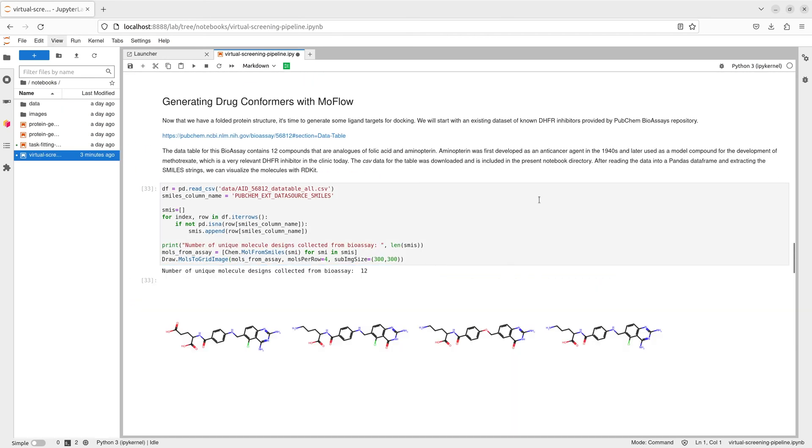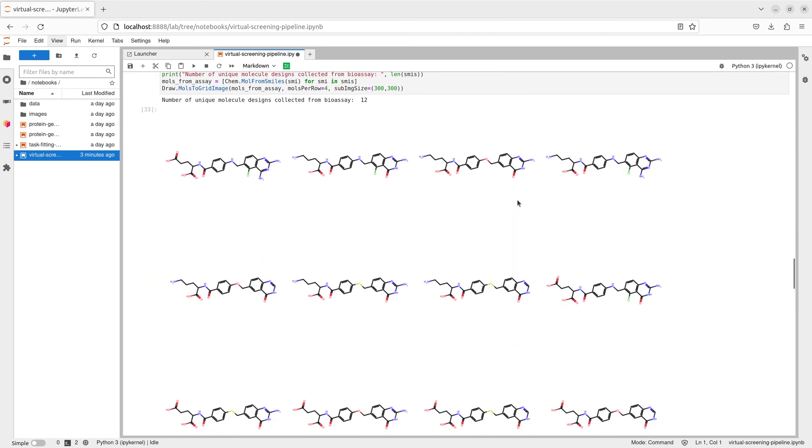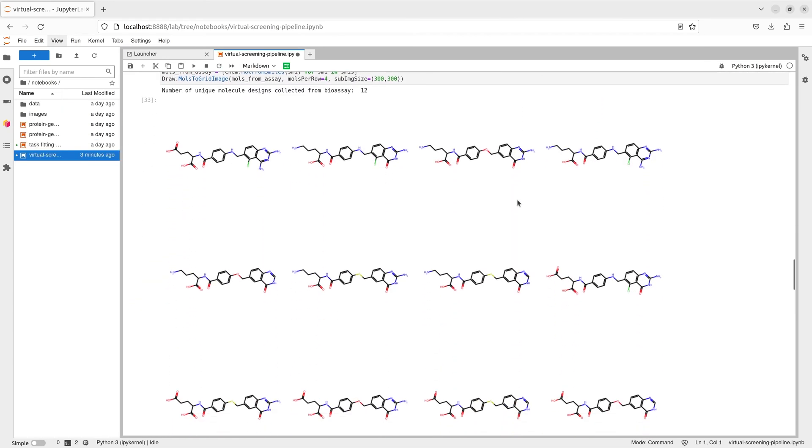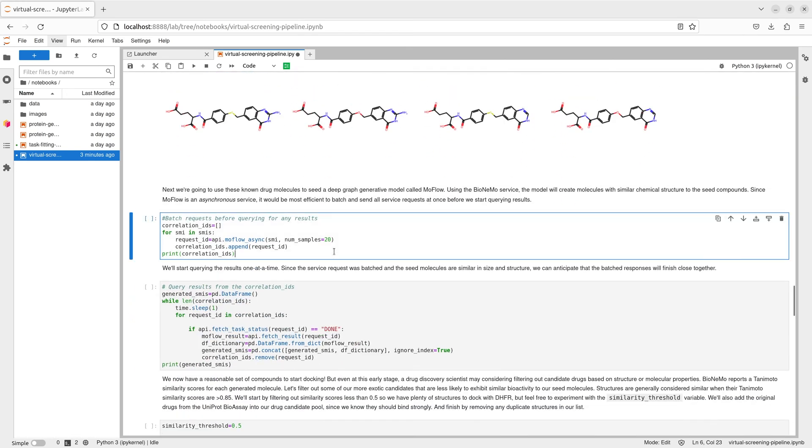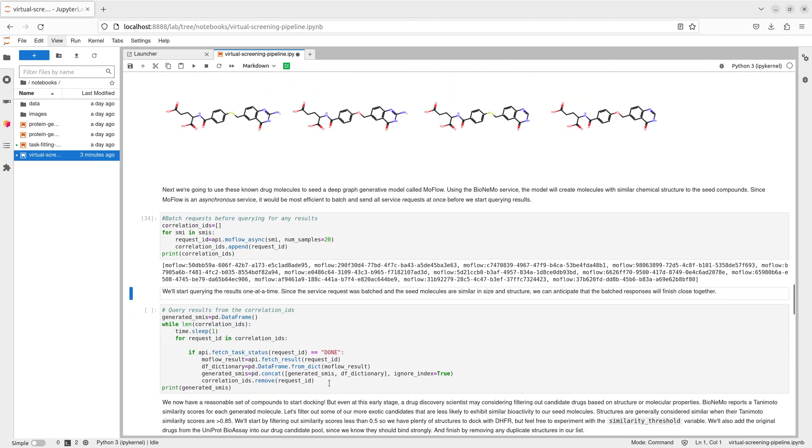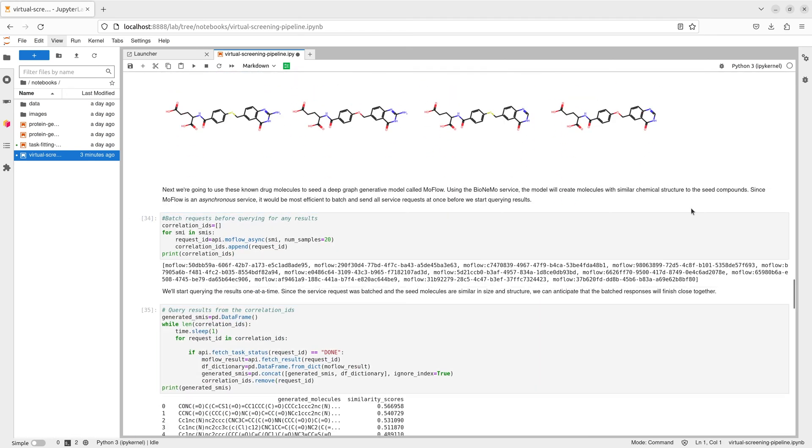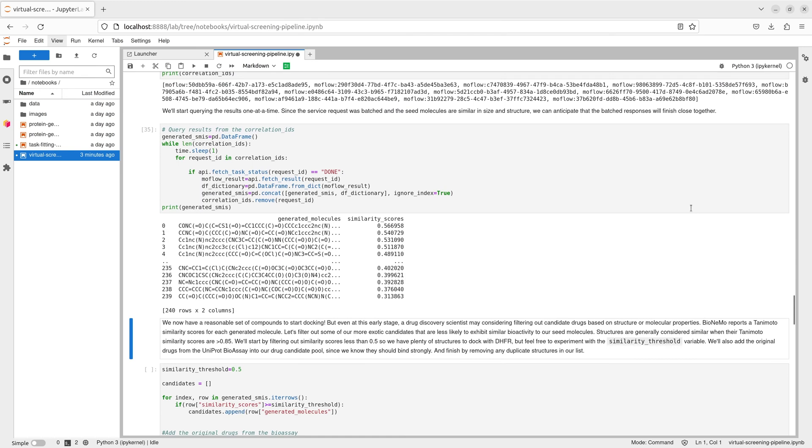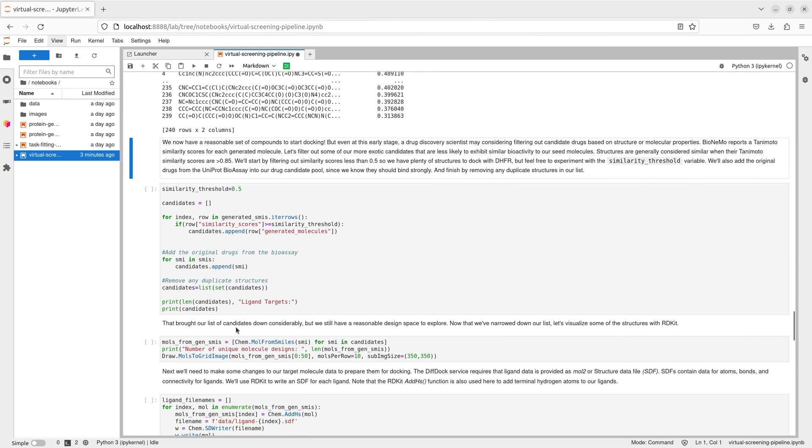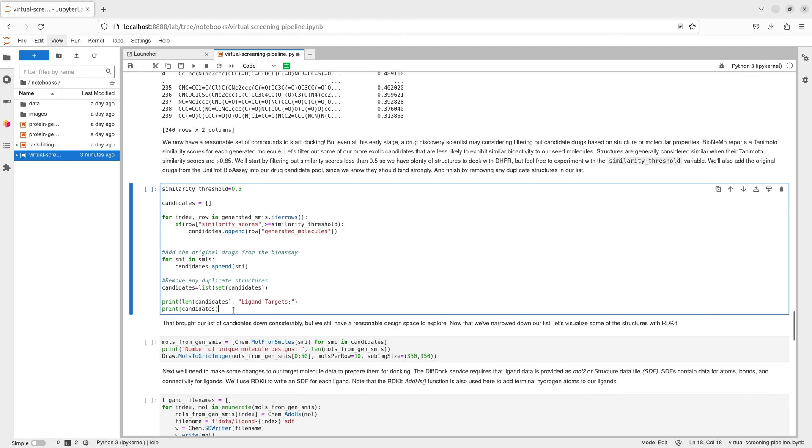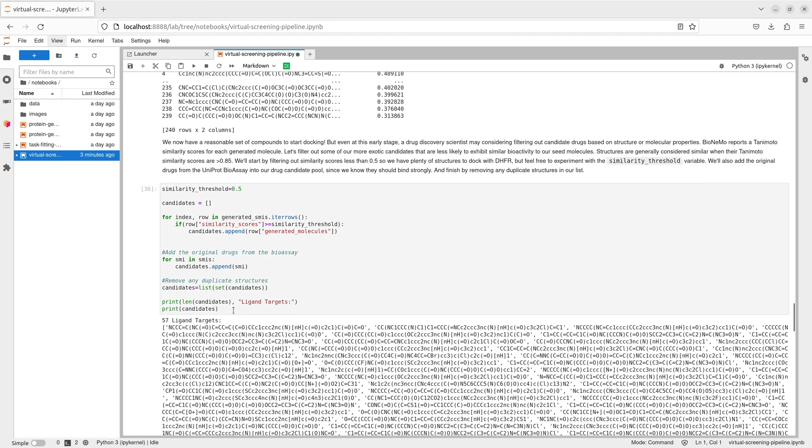The next step is generating a set of ligand targets to test docking characteristics. For this, we'll start with a small database of known DHFR inhibitors as a seed to the MoFLO deep graph generative model to create novel molecules with similar characteristics.